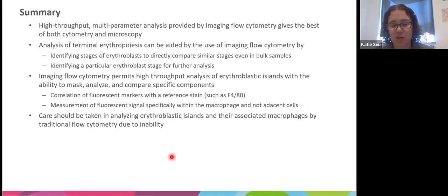So very broadly, like shape, CD71 intensity. You just kind of tell it, in broad strokes, what you think will help, and the machine learning will go through and come up with parameters and features that are very customized, and actually combine them and come up with ways to separate out the two cell populations that you're interested in separating out.